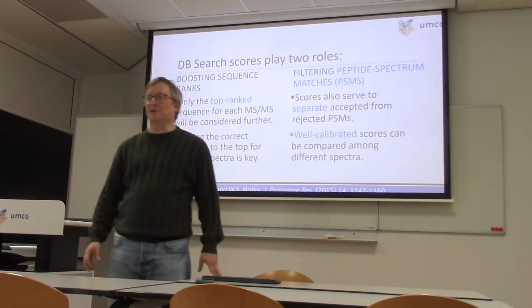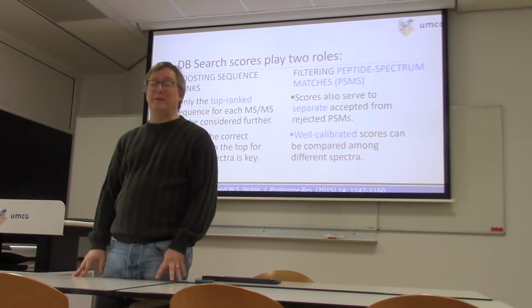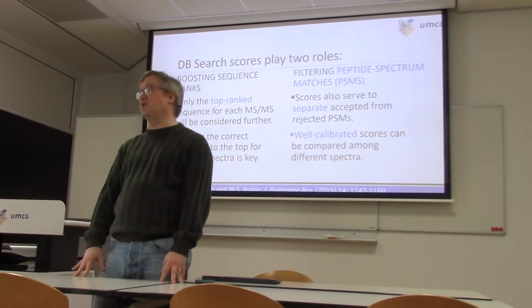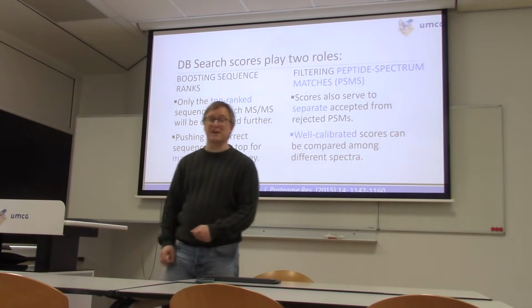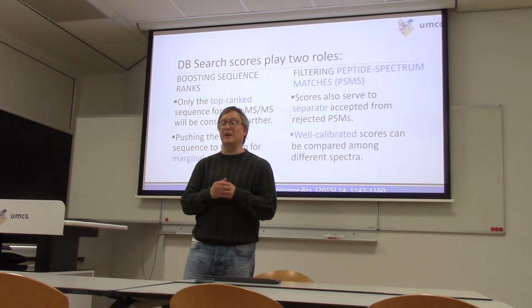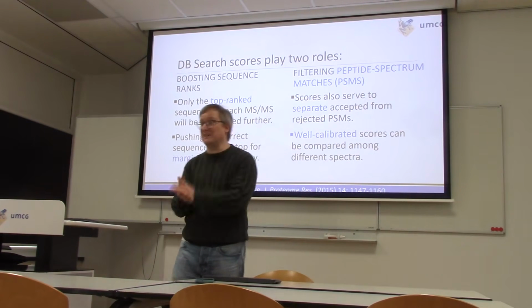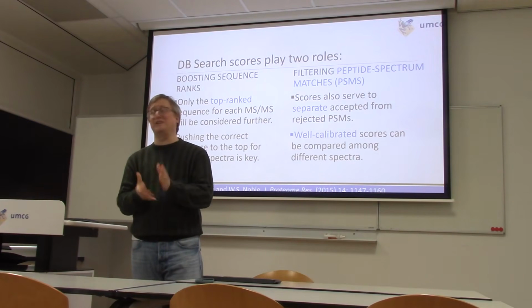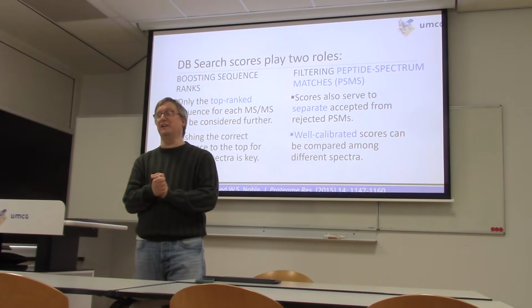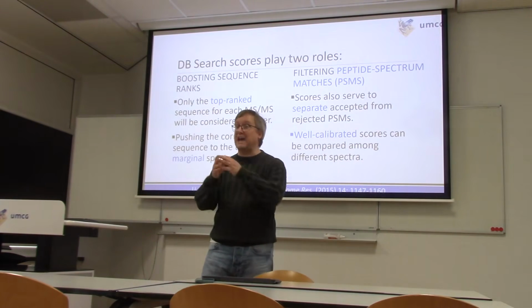Okay, so for part 2, we've already talked about how the peptides are produced from biological samples, how the peptides result in spectra and tandem mass spectra, and now we've talked about how we create a hypothesis about what peptide each MS represents. But we are not done. There's a lot of work left to do, and frankly, a lot of the emphasis in the proteome informatics field has moved to the tasks that I'm talking about in this latter half.